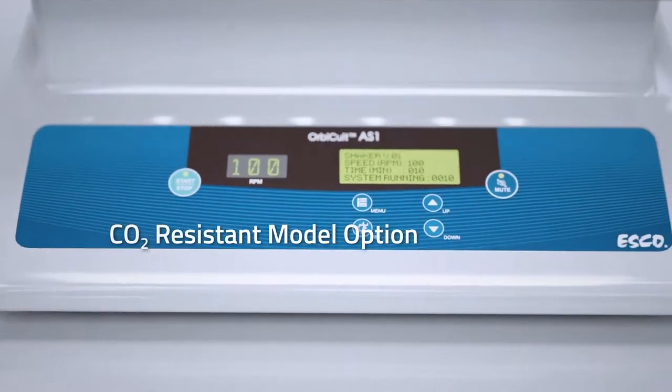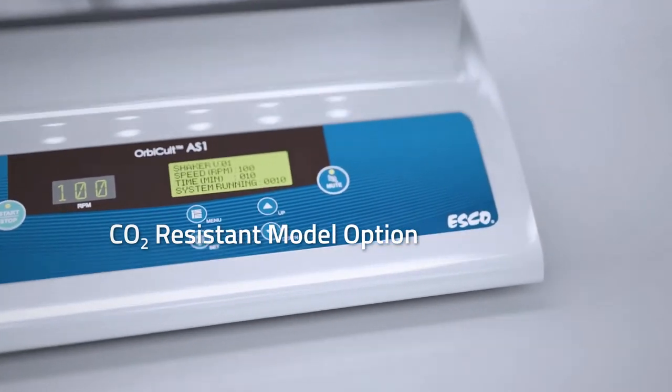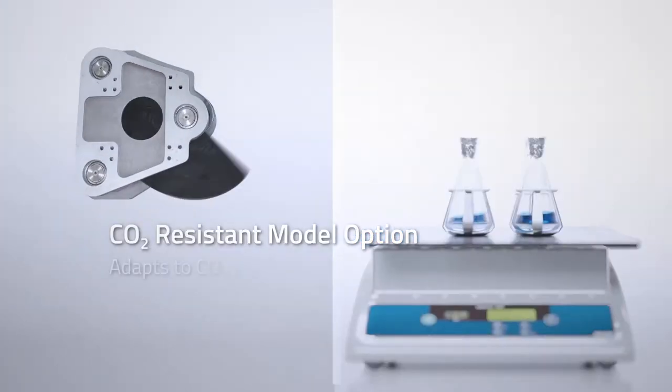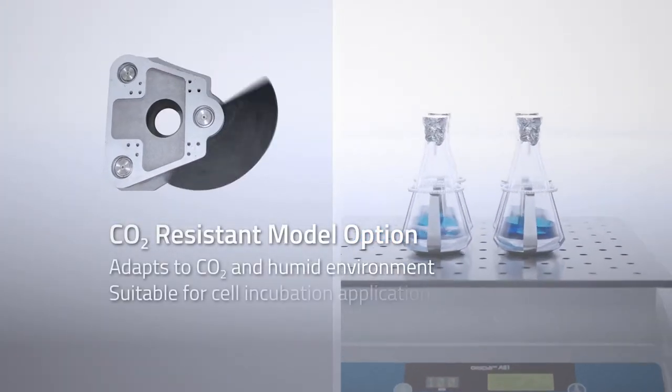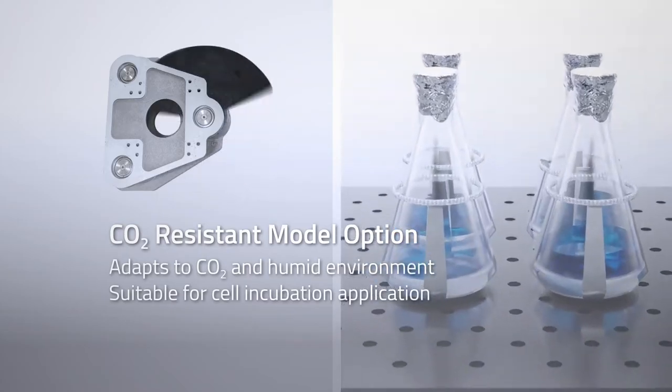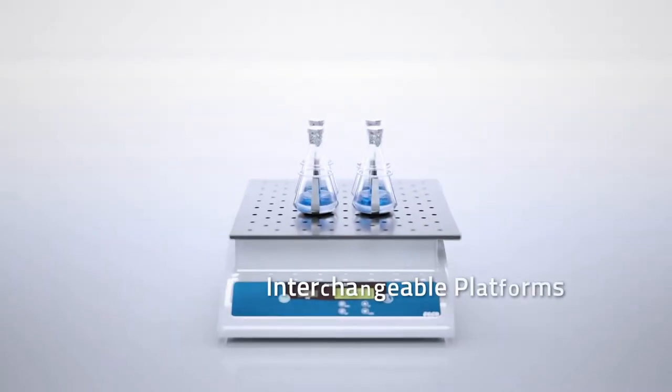CO2-resistant model option. It adapts to CO2 and humid environments suitable for cell incubation applications.